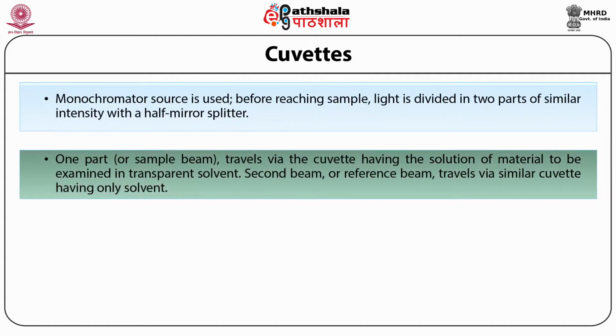So one part, or sample beam, travels via the cuvette, having the solution of the material to be examined in a transparent solvent.